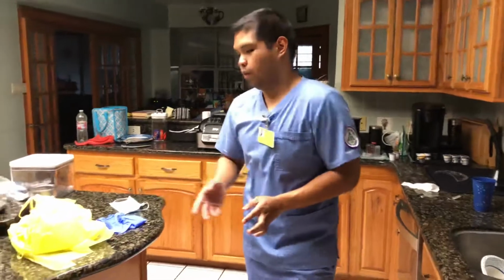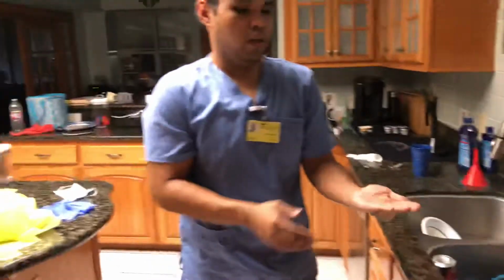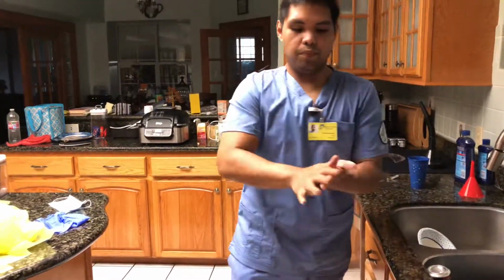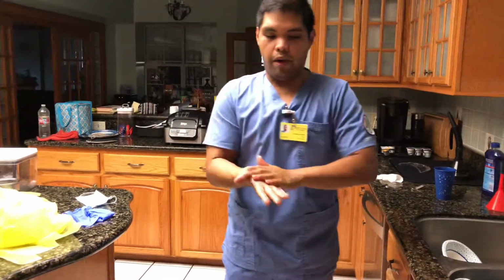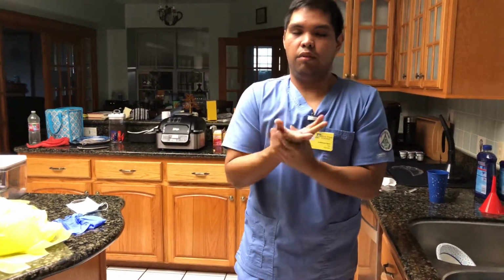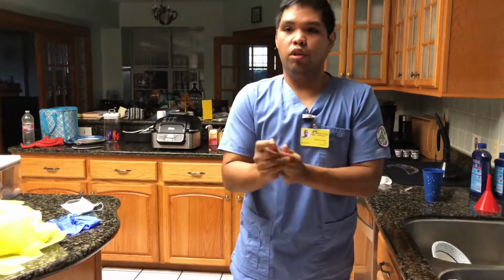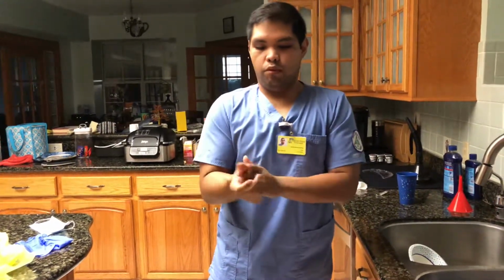So the first thing that we're gonna do is hand hygiene. You can either do this by washing your hands or using an antimicrobial rub. Like described in the previous video, we apply an amount and then you cover all the surfaces, the same thing as a hand washing, and we have to do this for at least 15 seconds or until the substance is completely evaporated. So you use circular motion and firm motion to get it. And so now my hands are dry.